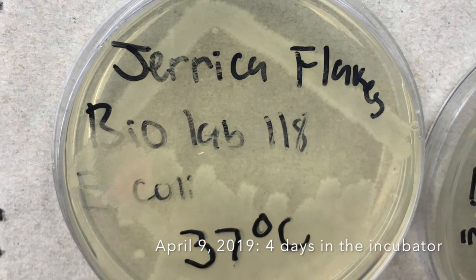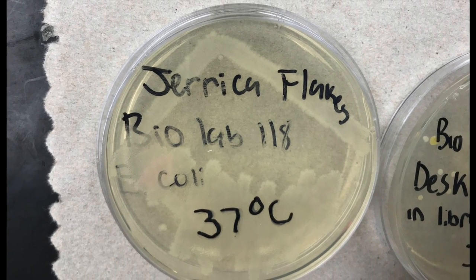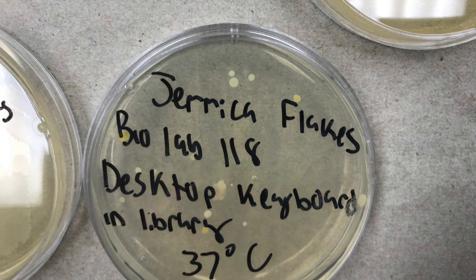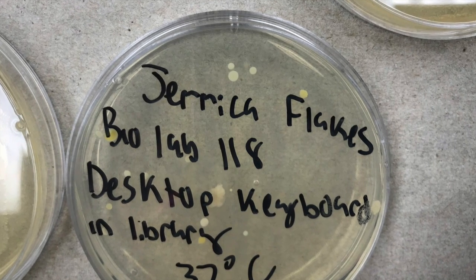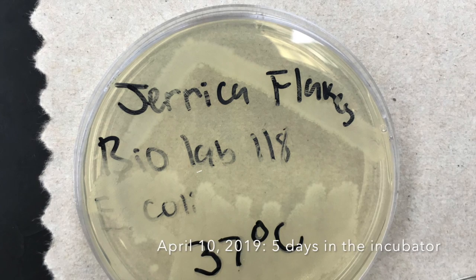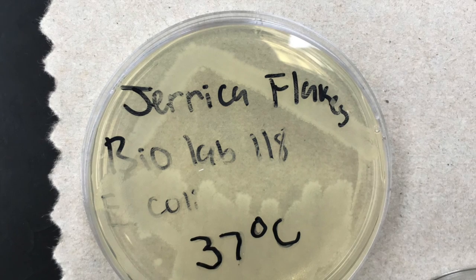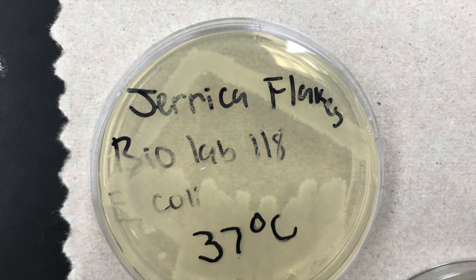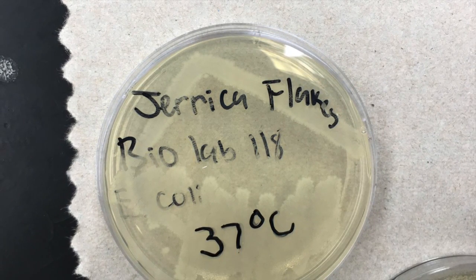On the 4th day, the E. coli became a lot more opaque and did not have sharp edges. The desktop swab, the bacterial cultures got whiter and a few more cultures popped up. On the 5th day, I was not able to tell where my swab lines were. On the 4th day, in person, I could tell that yes, I made this mark right here, but the lines started to run together on the 5th day.